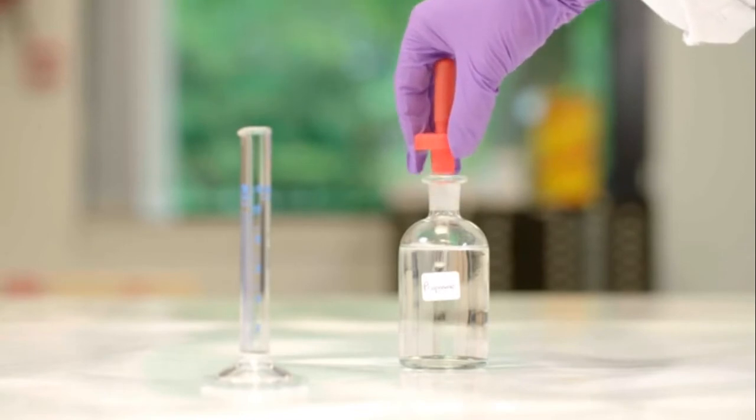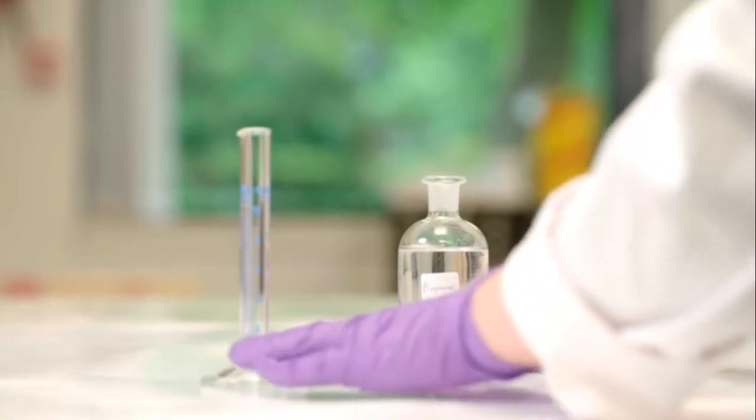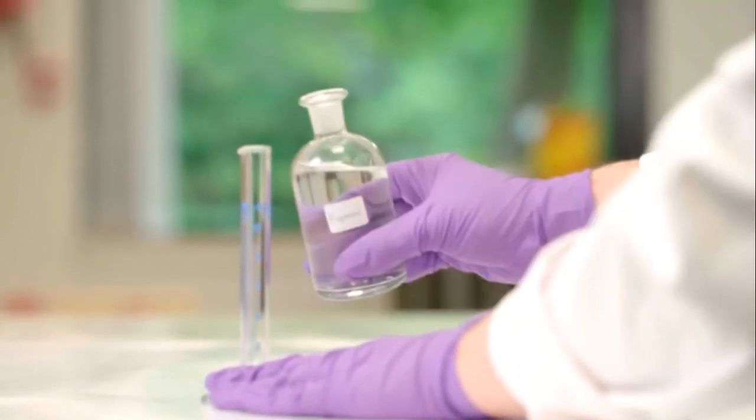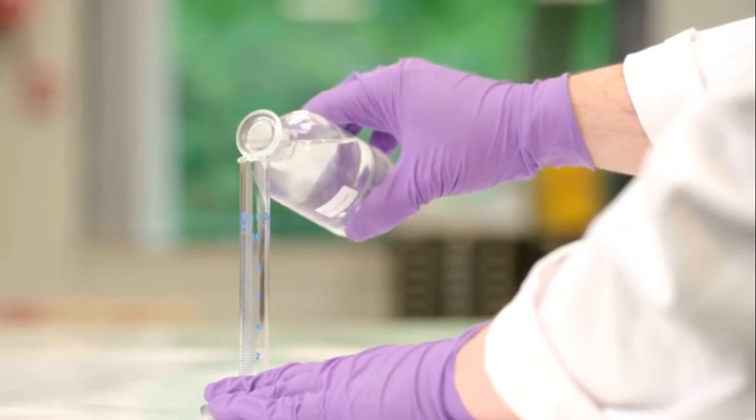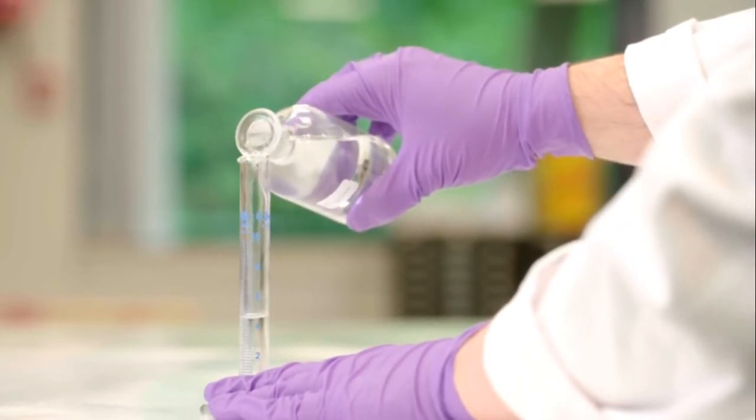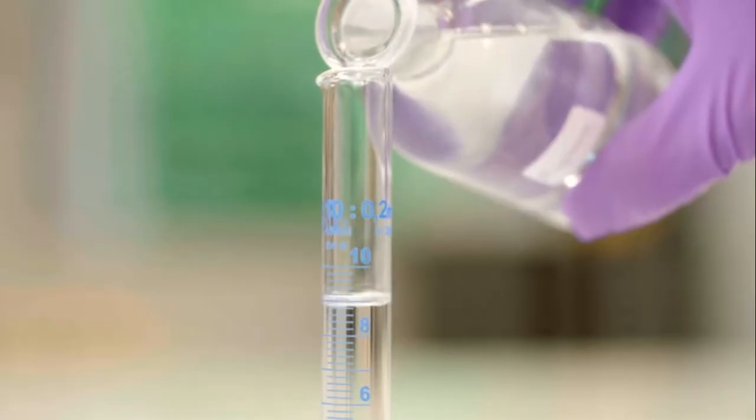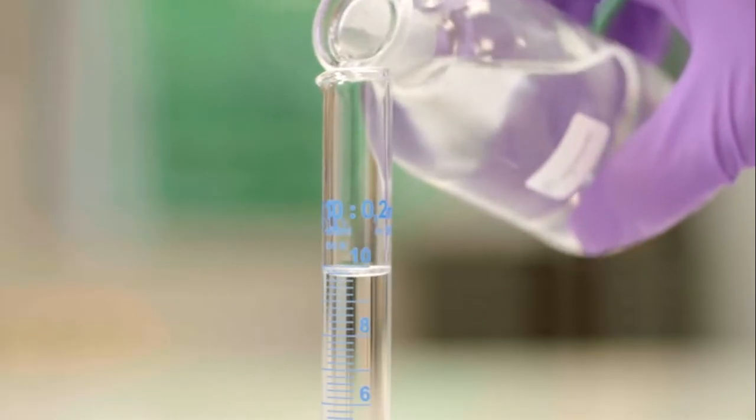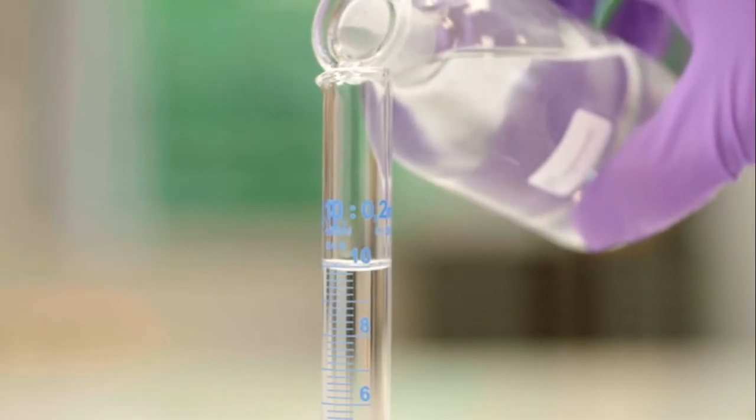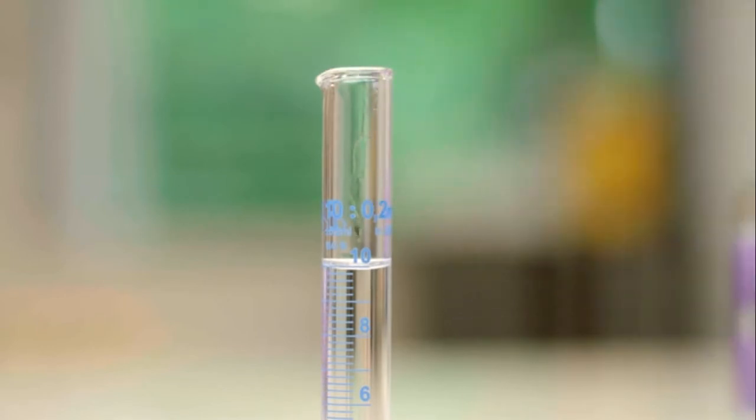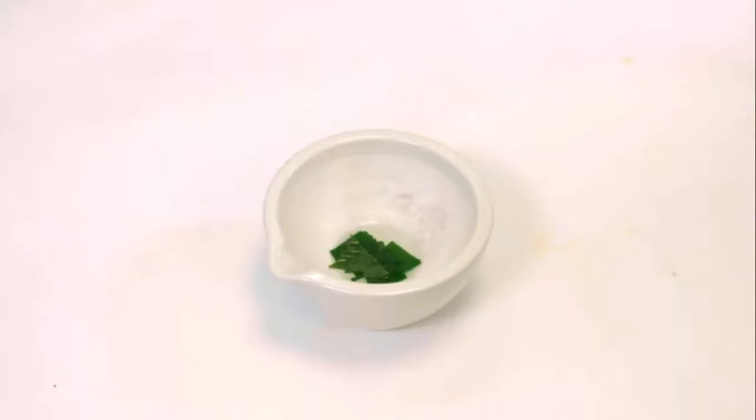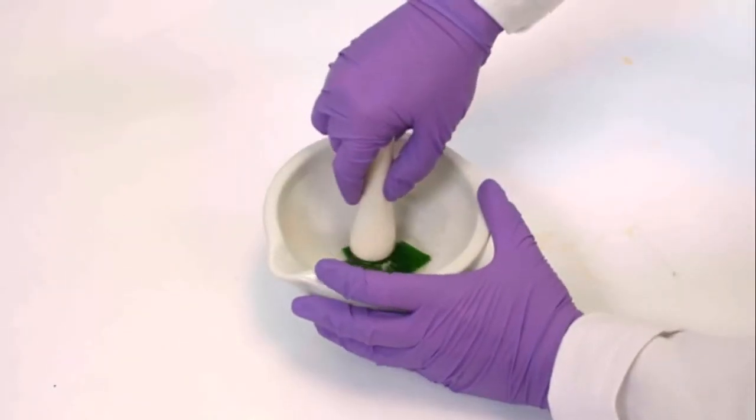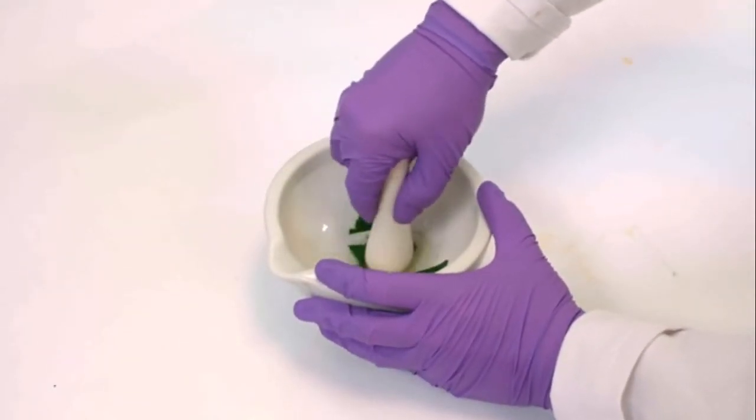10cm³ of propanone is measured out using the measuring cylinder and is then added to the mortar. The mixture is ground with the pestle for at least 2 minutes.